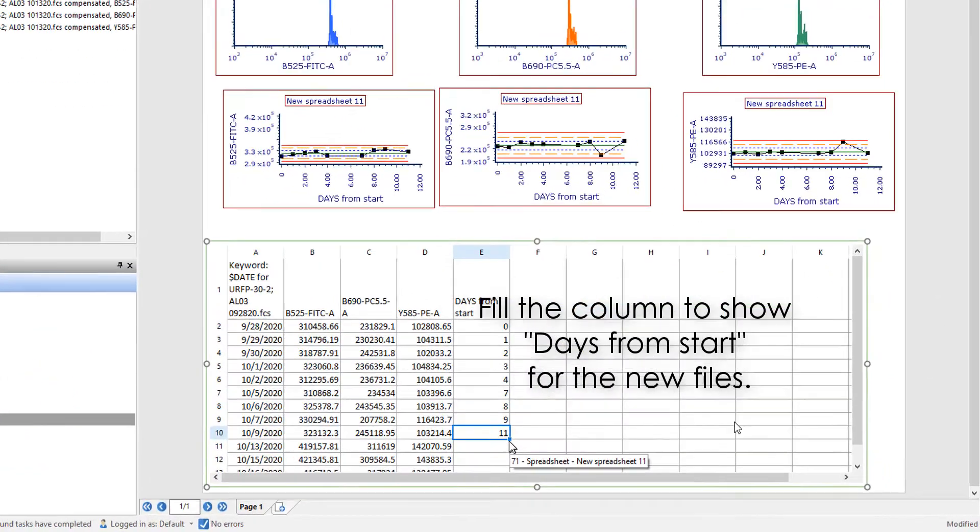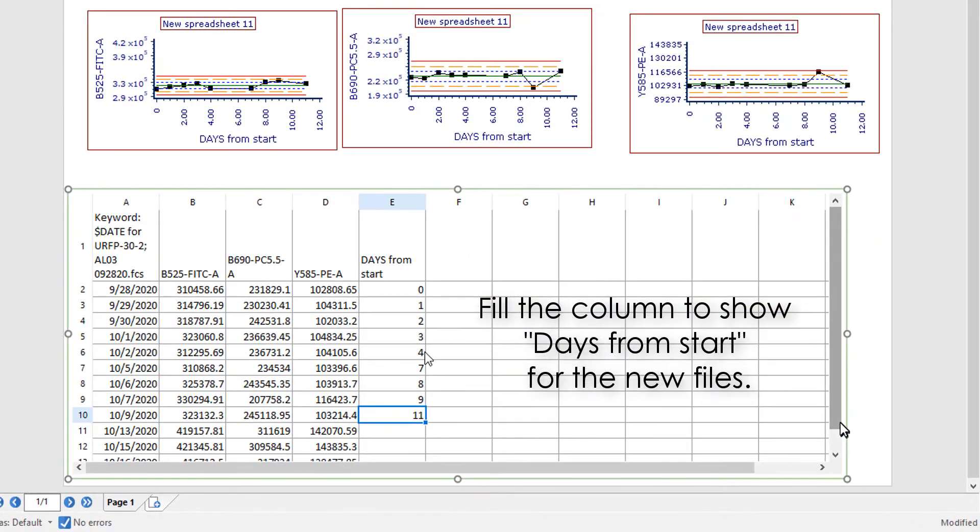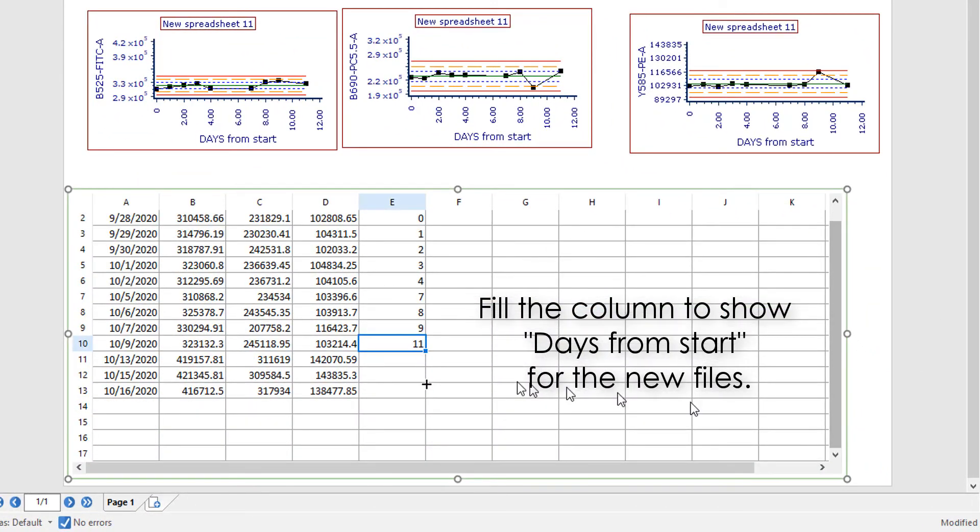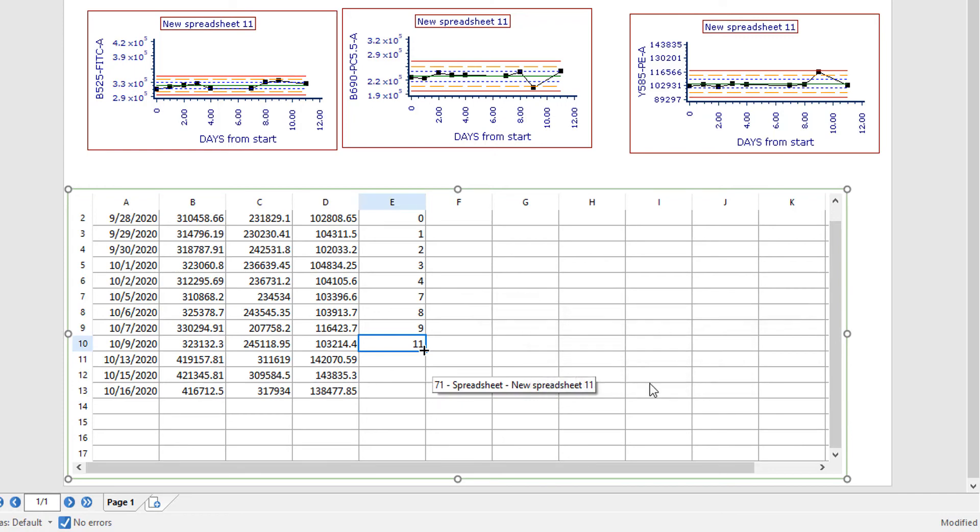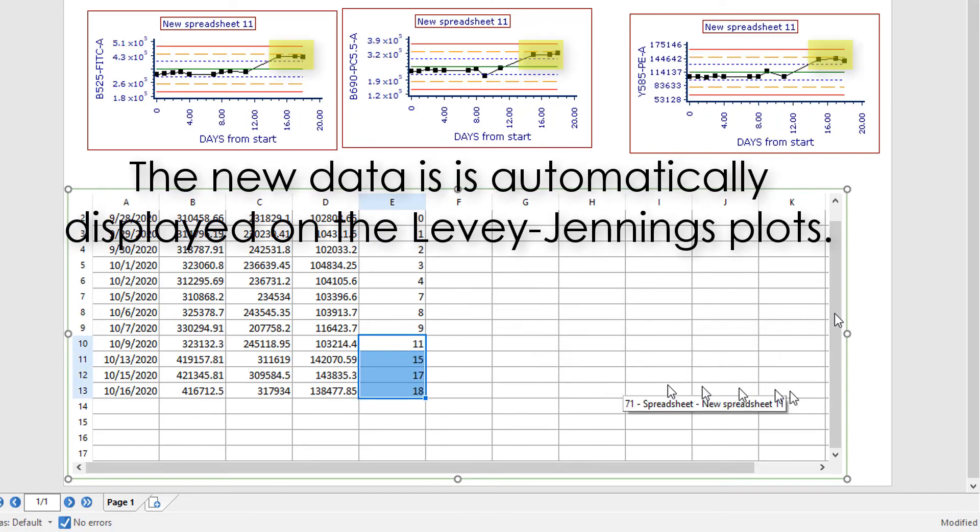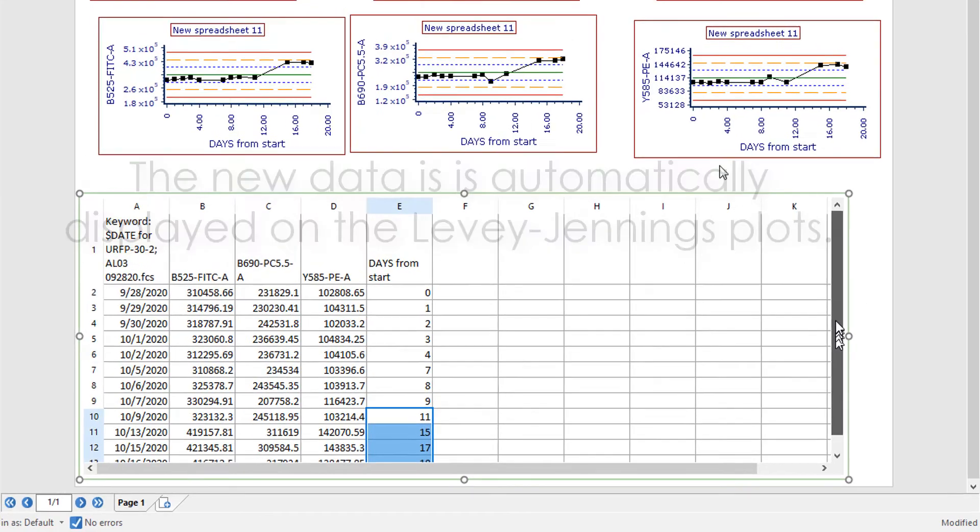Do a column fill in the Days from Start column for the subsequent data files. The QC data for the new dates is automatically displayed on the Levey-Jennings plots.